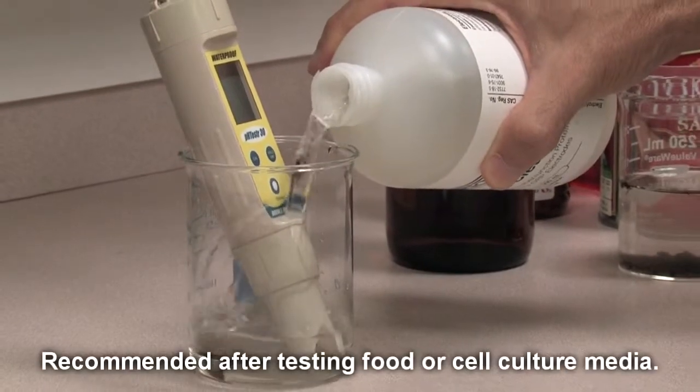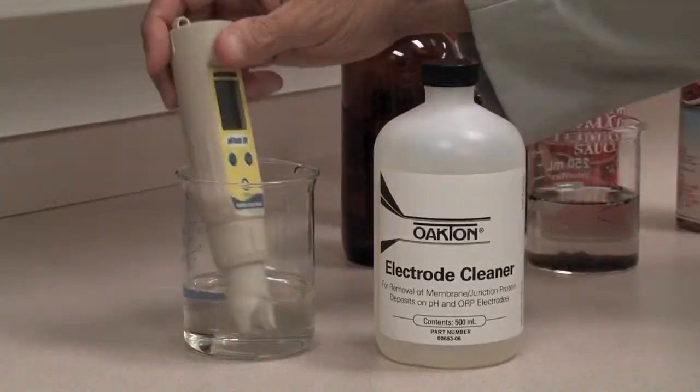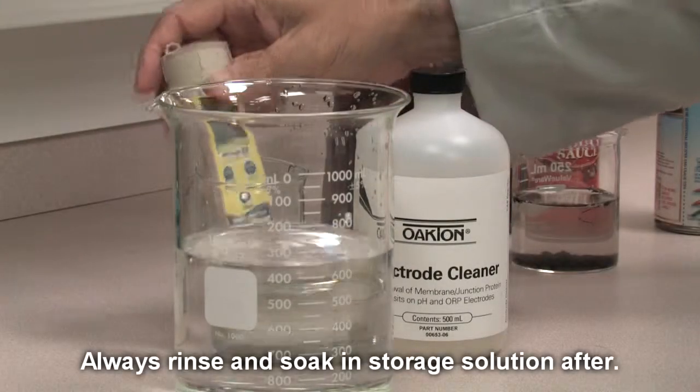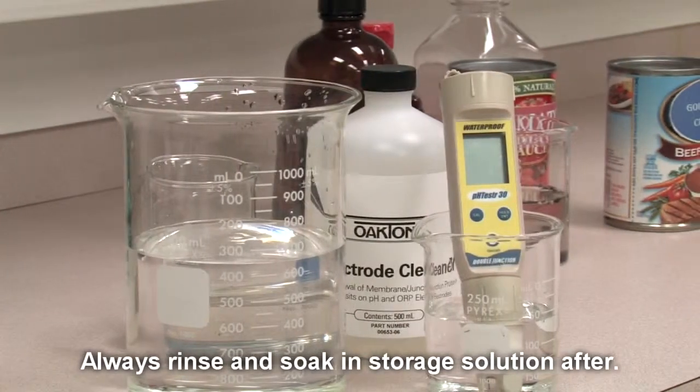For protein removal, soak the tester electrode in electrode protein remover solution overnight. The enzymes will remove proteins from glass and plastic. In the morning, rinse the electrode with deionized or distilled water and soak for 1 hour in storage solution.